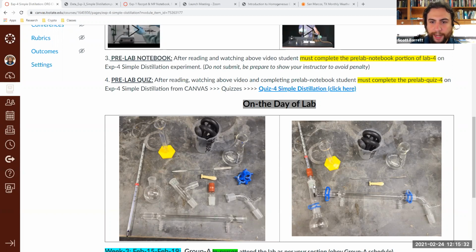And then what happens is as it condenses up here, because it's cooler up here, it'll actually come down the condenser. The water line, the hose, would be connected right here, shooting water up into it. And then there would be another hose coming out of it, going out into your sink or something that would allow you to get rid of the hot water.